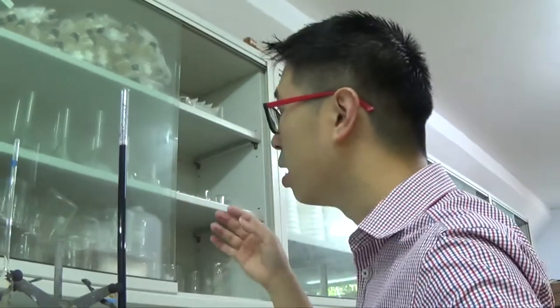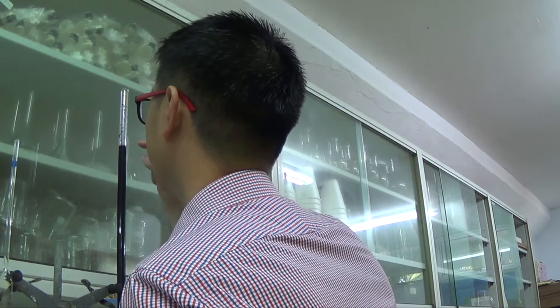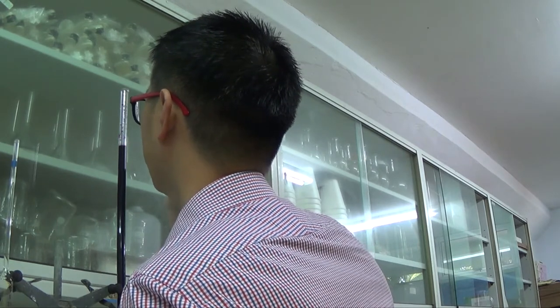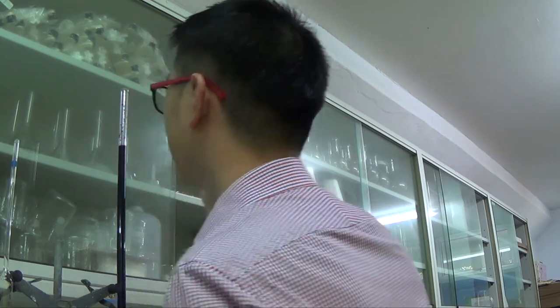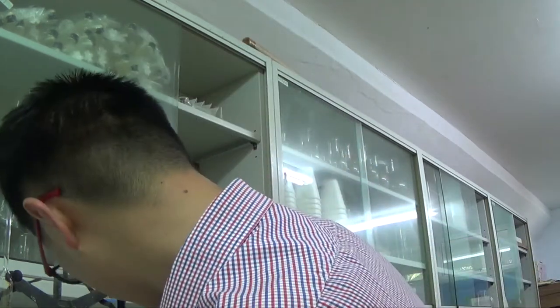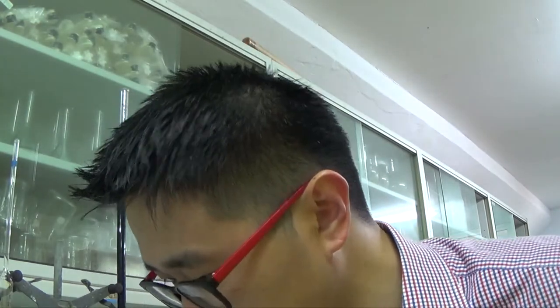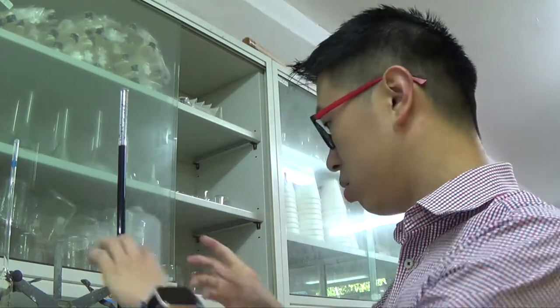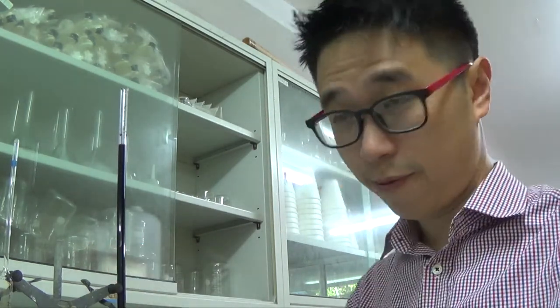Oops. So at eye level, I read above the meniscus because this is a dark solution. So this is 2.5, 2.6, 2.7. But 2.7 would be wrong, so that's 2.70 initial reading. 2.70 initial reading. So we'll just let it flow.